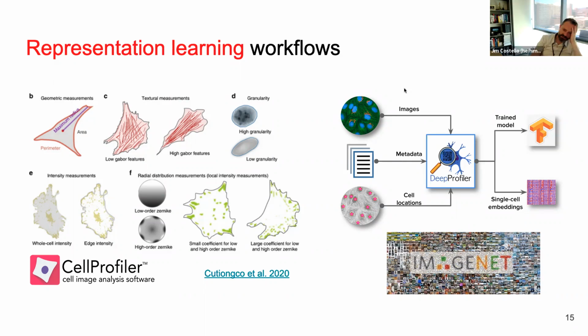Cool. And then on cell size, that might not be a huge factor because most cells are pretty similar in size, but there are cells that are much smaller and cells that are much bigger. Does the resolution have an impact on all of these models? I would assume it would, but... Yeah, I think that's a research question. The field is so new that we haven't answered that, or at least I haven't seen it answered in any way, really. Okay. Yeah, I think it's really interesting.